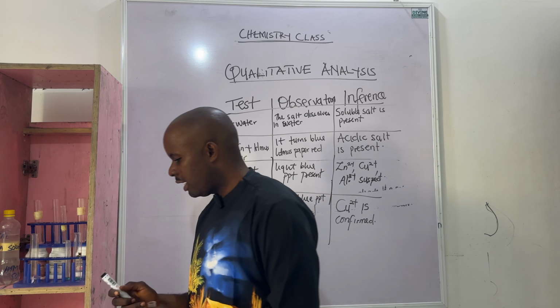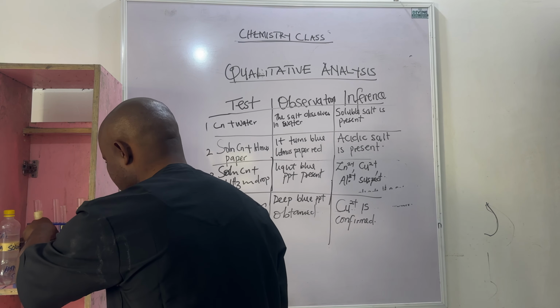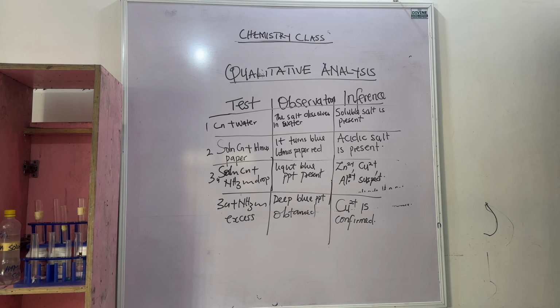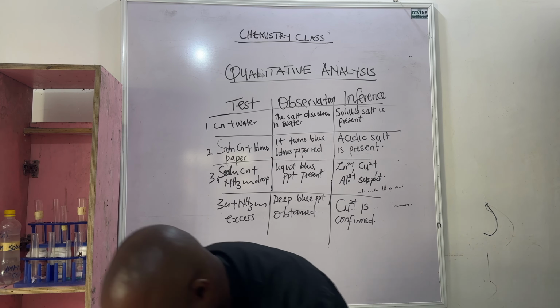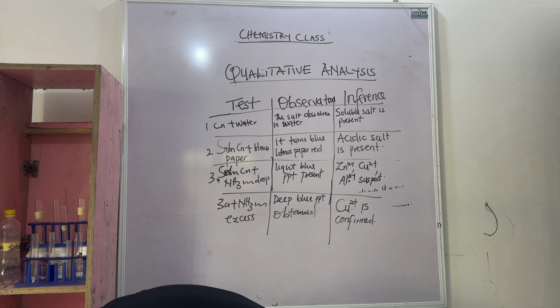So let's talk about another salt. Let's use a very different salt here. Okay, we're going to follow the same format.